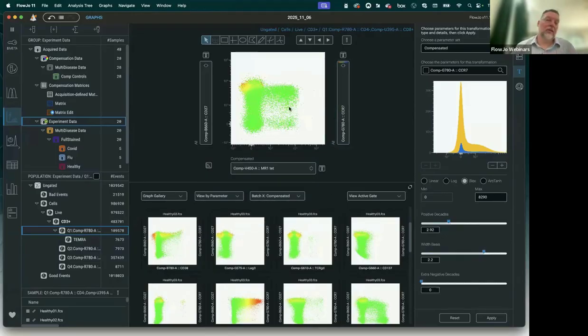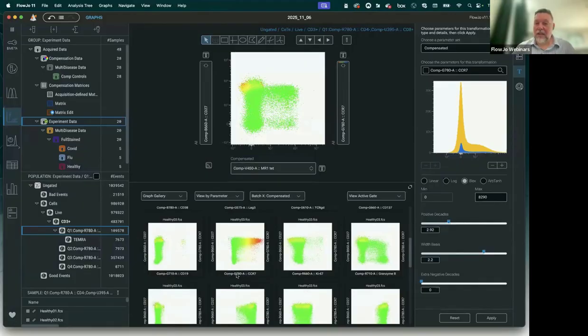And most people use the color maps once you do a tSNE or UMAP, and then you color map each of the other channels so that you can see where the lineages are and where expression is in that map. But this is an example. And of course, as I mentioned earlier, like V10, we've now synced with the transform range so that you get red at the top, blue at the bottom, and green and yellow in the middle.